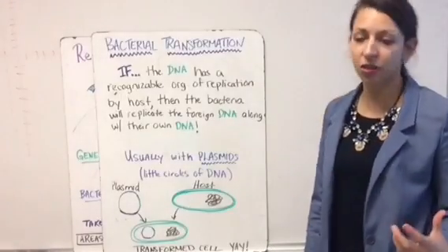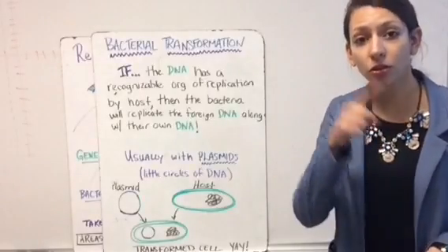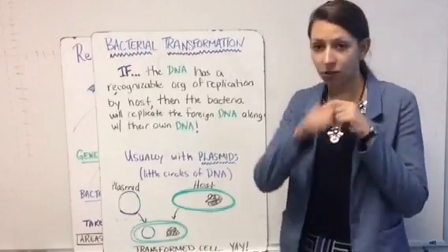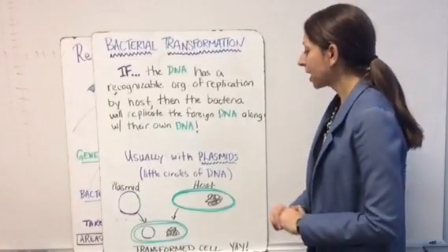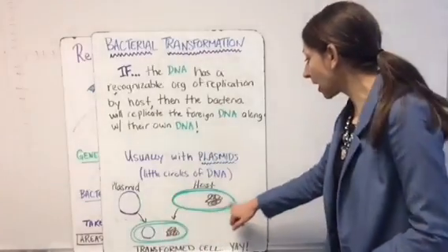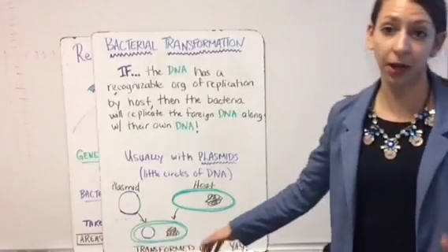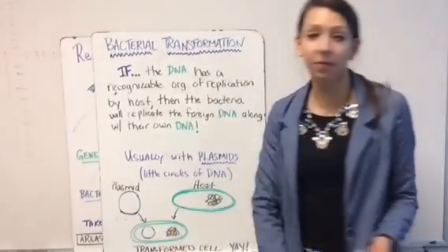So we're going to usually do this with plasmids, and plasmids, if you haven't watched any other videos, are little circular pieces of DNA that generally are going to exist in smaller things like bacteria. So these are double-stranded, they're in a circle, and they're very small, they're not very many bases long, and hopefully, if it works, we'll incorporate the plasmid into the host, and then we'll have a transformed cell. Yay! And then when that particular bacterium starts to reproduce, it'll reproduce with that transformed plasmid as well.